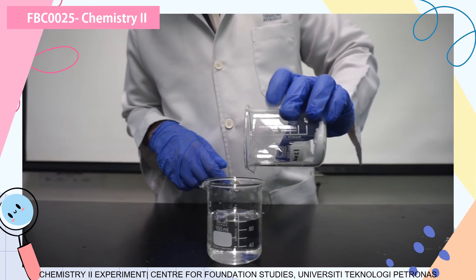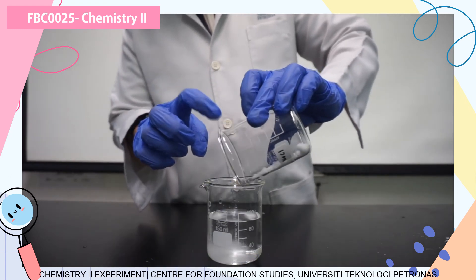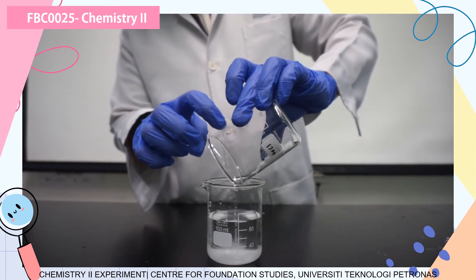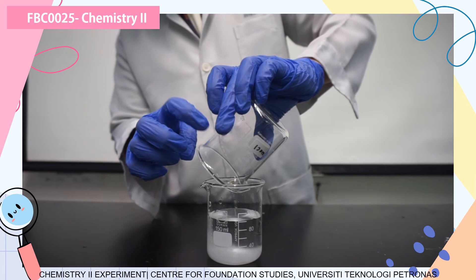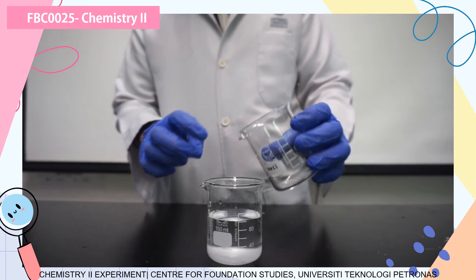Once you have completed determining the boiling temperature of your water, we are going to add the solute into it. You have to be careful because it's hot water there. We are going to add the sodium chloride with the measurement as given in the lab manual. Once you put it in, you are going to stir it so that the sodium chloride will dissolve.